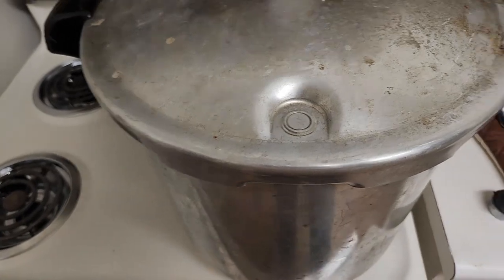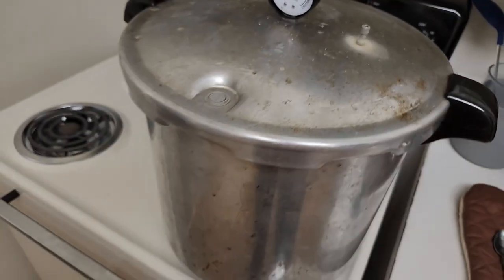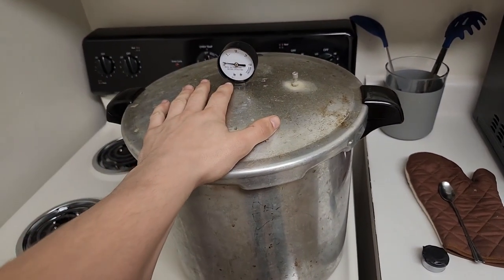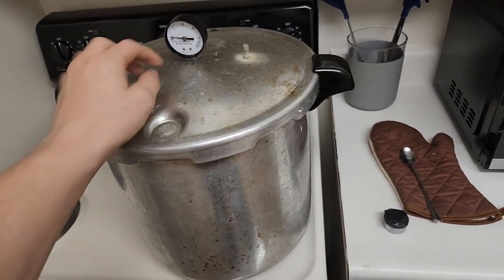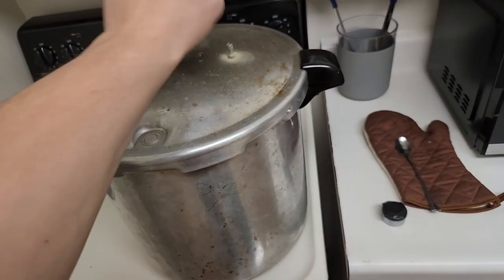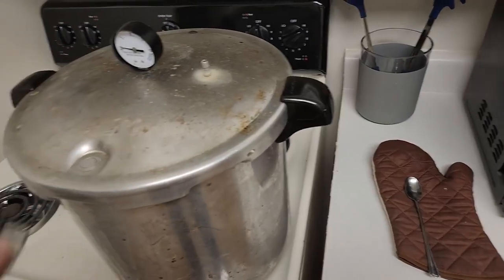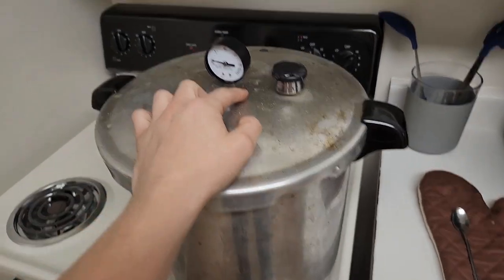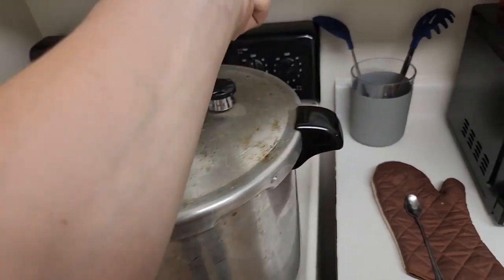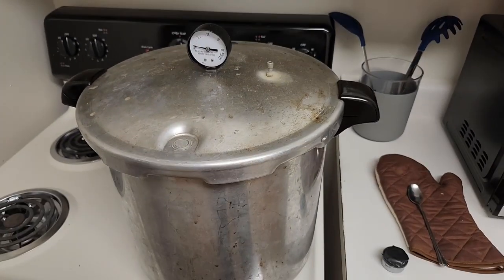When you're sterilizing liquids, they sterilize very quickly. So my process is I turn the heat on high and I'll let that purge out the steam for about 15 minutes. Once this thing pops up, it'll start shooting out steam there. I let that run for 10 or 15 minutes. Then I just put the weight on top. I let it get to around 15 to 17 PSI, and then I just shut the heat right off. I don't let it sit there for any amount of time.